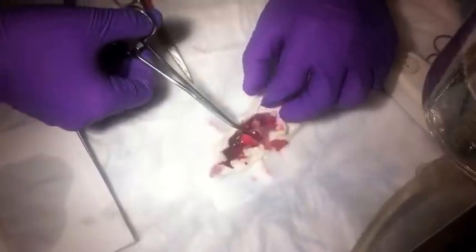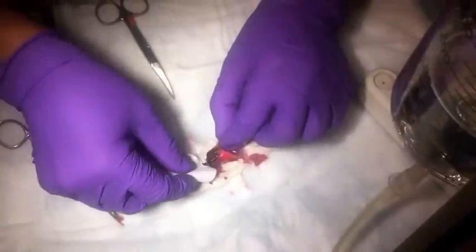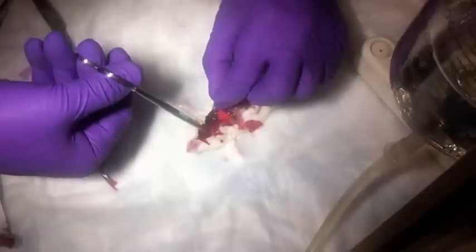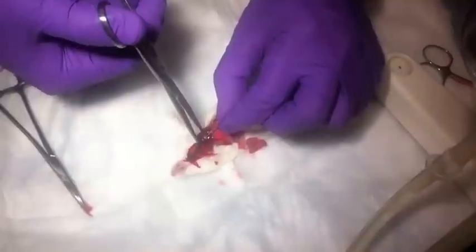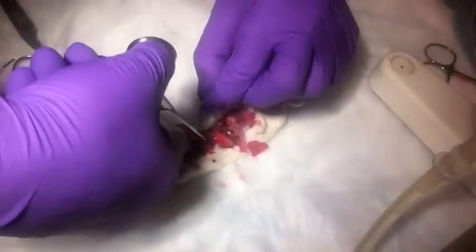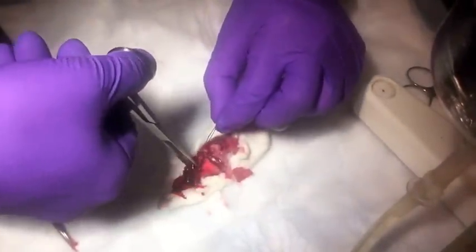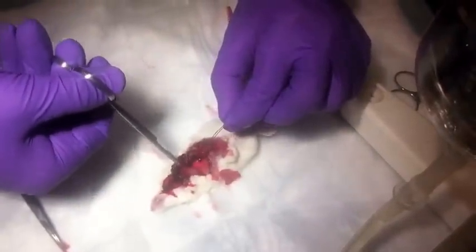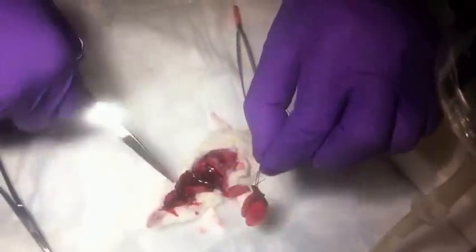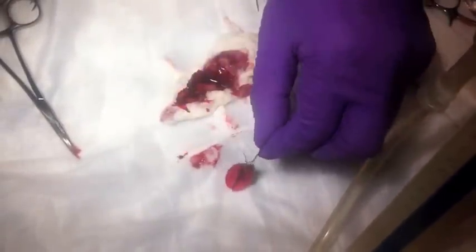Now we're going to excise the heart and lung from the thorax. It's easiest to pull on the trachea gently and lift the whole heart-lung complex up so you can cut underneath it and cut the connective tissues holding it in place. When you get down to the diaphragm, you need to cut the aorta, esophagus, and inferior vena cava. Then we're left with the heart, the lungs, and the esophagus.